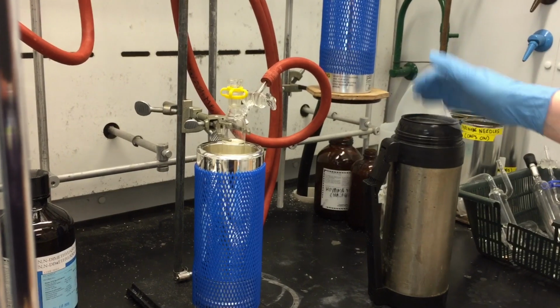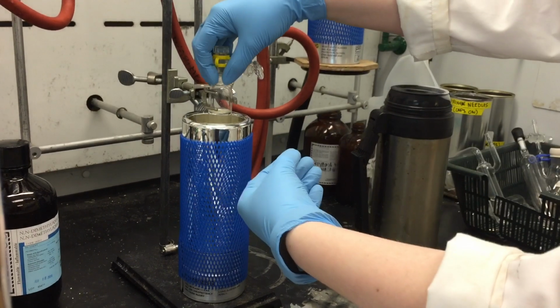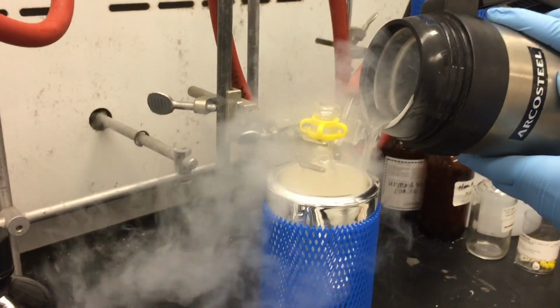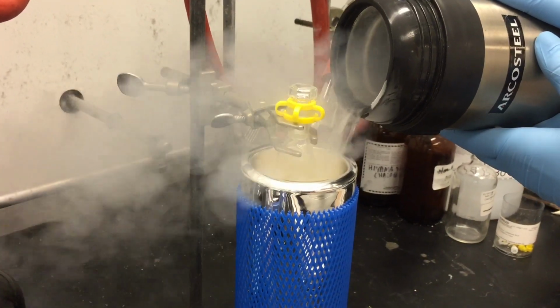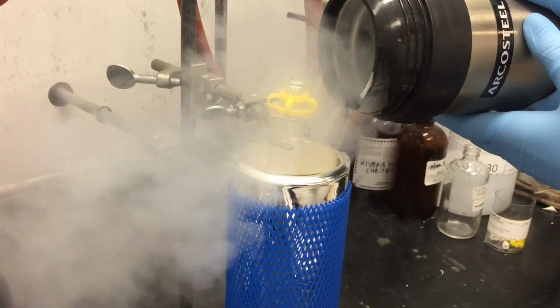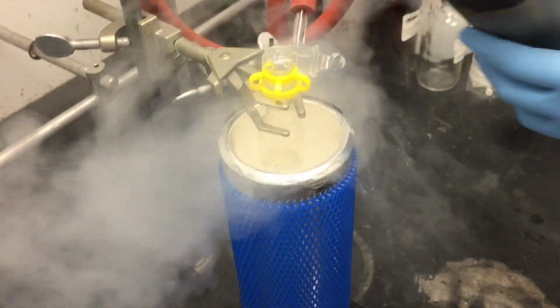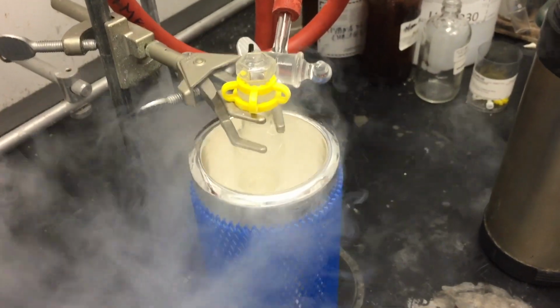Ideally, you would like to have the liquid nitrogen at the same line as your solvent. So I'm going to lower it a little bit further in order to get full coverage. So I'm going to pour in the liquid nitrogen. You can see that the line of the liquid nitrogen is roughly where the line of my solvent is. So we're just going to let it freeze.